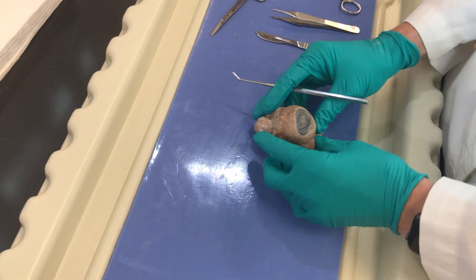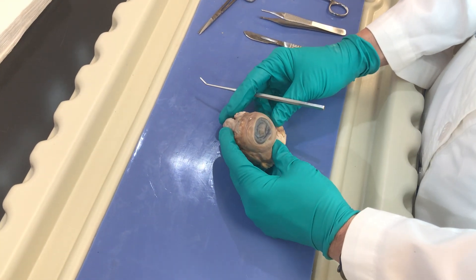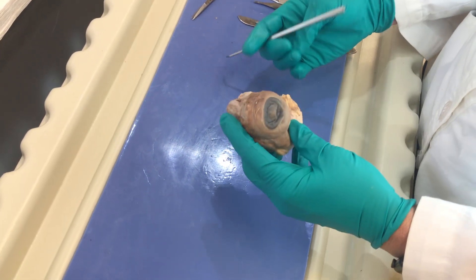Hello students, today we're going to be dissecting a cow eyeball. As always, you want to orient yourself with the structures externally.